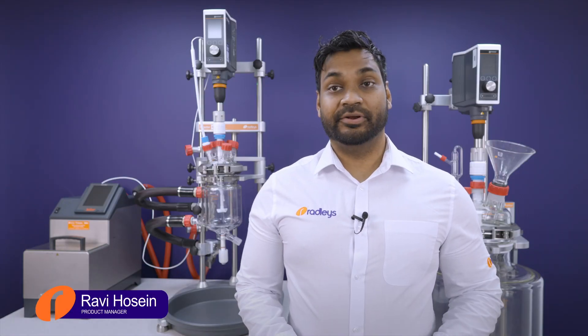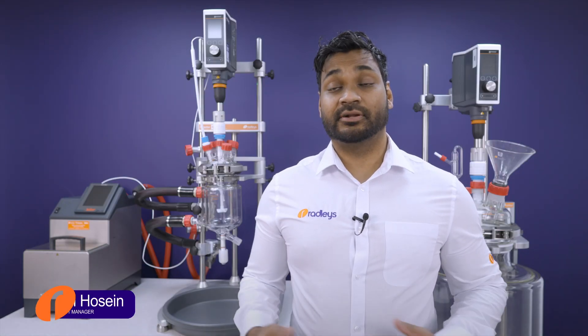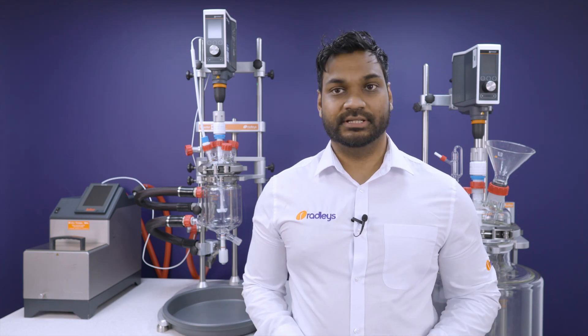At Radleys we have decades of experience in producing reactors for scientific research as well as GMP production. These jacketed lab reactors, like our Reactor Ready range, are designed to give users the best possible control over temperature, stirring, and other parameters such as pH.